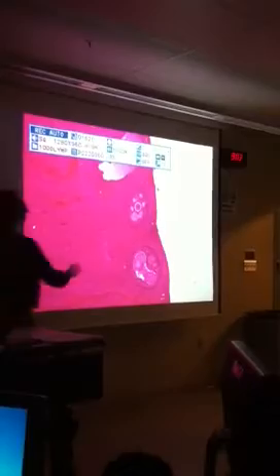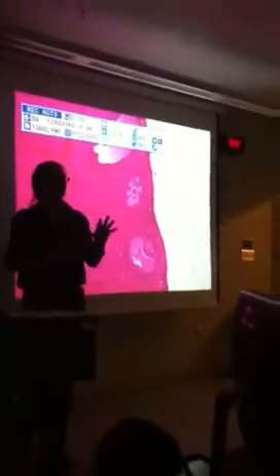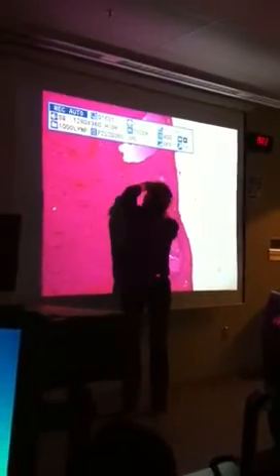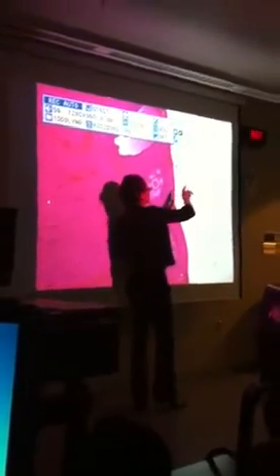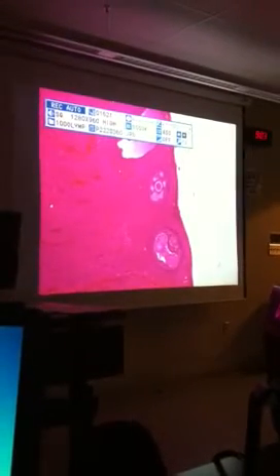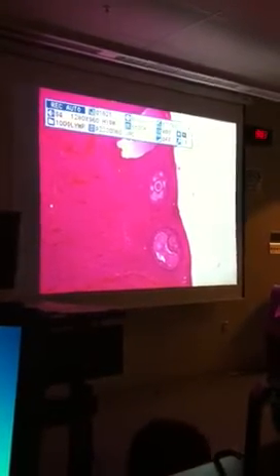introduce another. So this whole thing here is the follicle, and then that brown part in the middle, that's the oocyte. So during ovulation, what's going to happen is the follicle is going to rupture, and that oocyte's going to come out of the follicle, out of the ovary, and then get swept up into the fallopian tubes. So you'll see different sizes because they're in different stages of development.